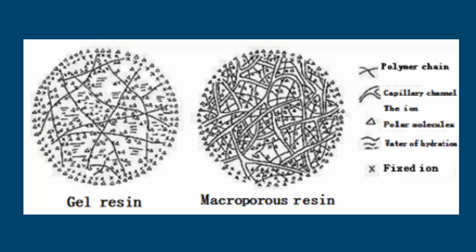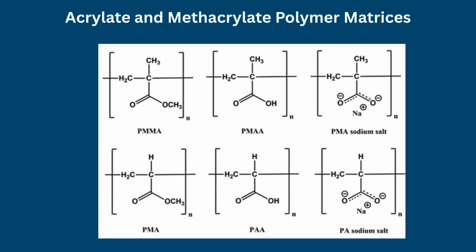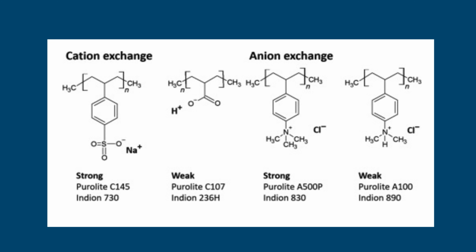Modern chromatographic media can also use agarose, cellulose, acrylic/methacrylate polymers, silica polymer hybrids, and other matrices, particularly when protein biocompatibility, mechanical strength, or high-pressure operation is important.